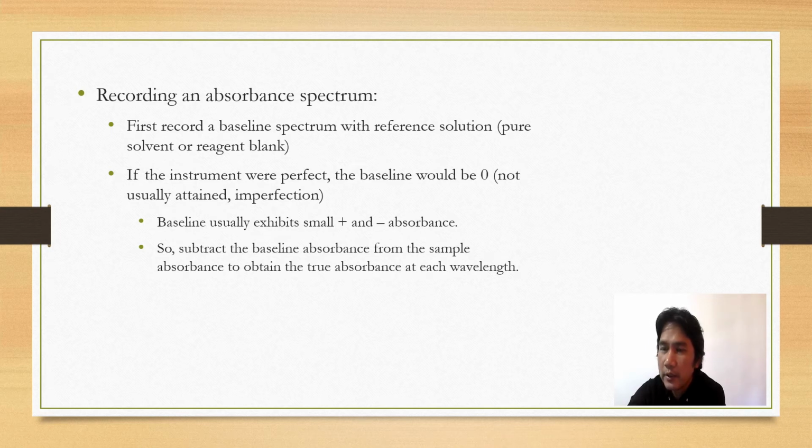Okay, and then after we get the absorbance of the reagent blank, we subtract the baseline absorbance from the absorbance of the sample.